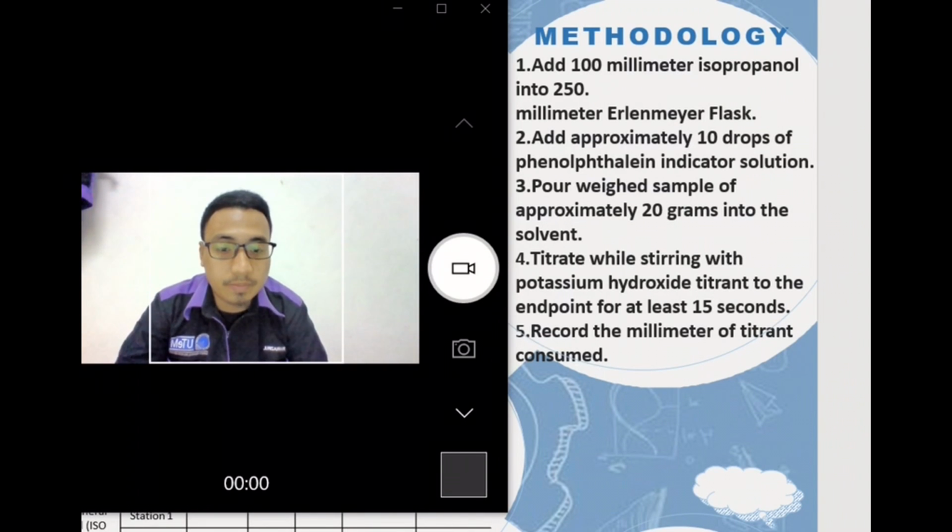And for the last step, record the milliliters of titrant consumed. That's all from me. Thank you.